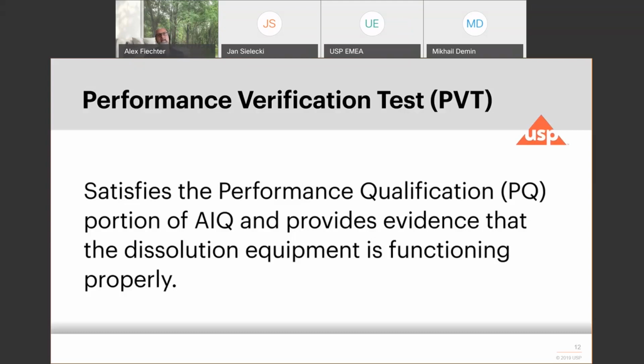just think of the fact that as soon as something goes wrong, and the dissolution tester is the faulty part, your drug product is released in the wrong way, giving you results based on the performance of the dissolution tester, not on the formulation. You identify this as an issue.